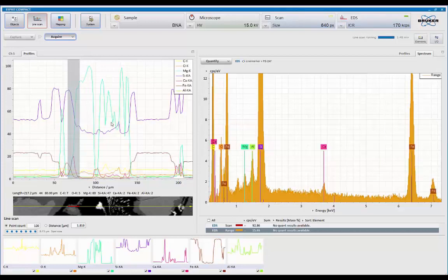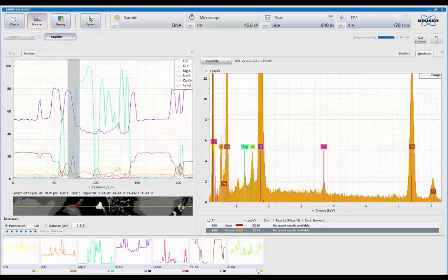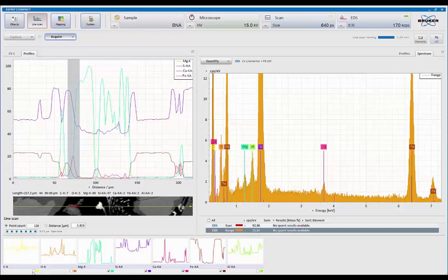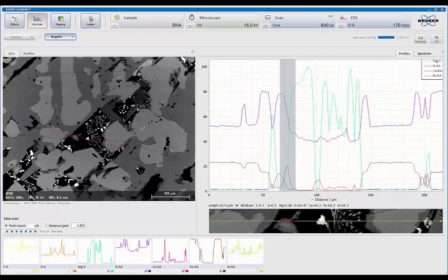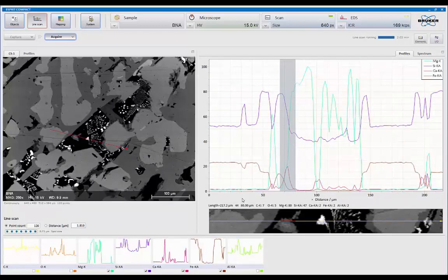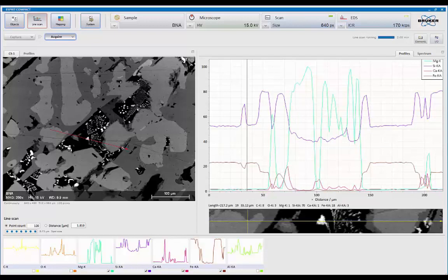So now I have my individuals here. And I have my composite here. And you can turn on or off, just like you could in mapping, any elements that you may not want overlaid at this point. Clicking on Profiles, switches everything back. You can also change things like the thickness of the line, if you wish, for your reports. Or leave it as this.